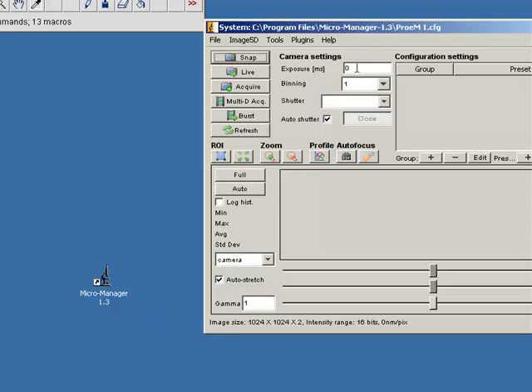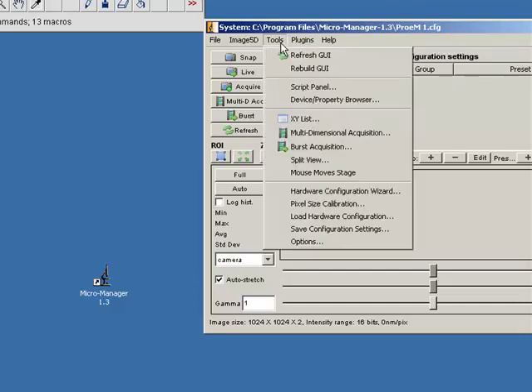The camera I've got here is the ProEM 1024. So it's the 1024 by 1024 back illuminated sensor, which will go at about 8 frames a second. So if we need to enter in exposure time. The other thing to note is that this camera only runs in clear pre-sequence.